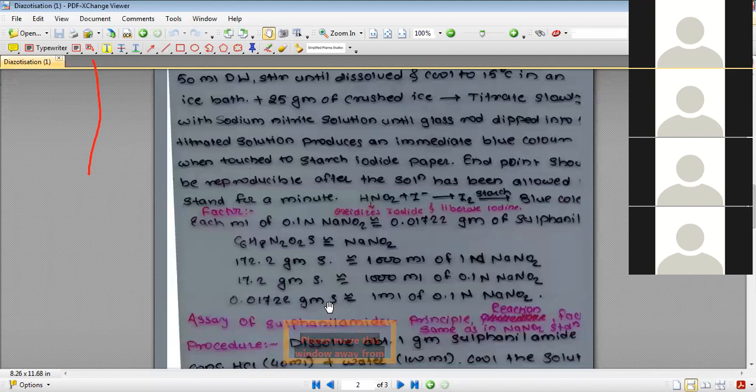The third main application of diazotization titration is the analysis of drug substances by conversion of the amino group through a chemical reaction. If a drug substance does not contain a primary aromatic amine group, then we can apply different chemical reactions to convert it into an amino group and analyze it. The first method is the reduction process.